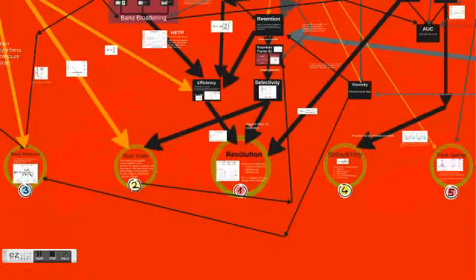The main responses are on the bottom of the concept map. These are back pressure, runtime, resolution, sensitivity, and peak tailing. To start off, we're going to have a look at resolution, as it's the most important response, and what factors will affect it.